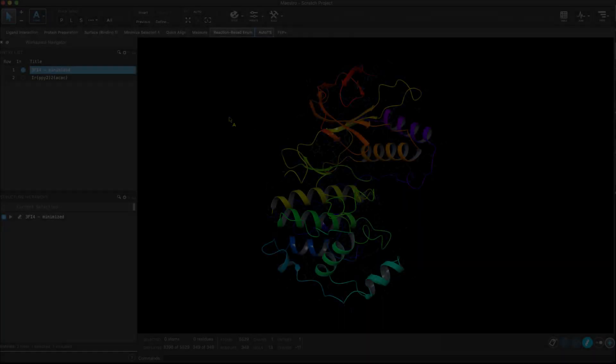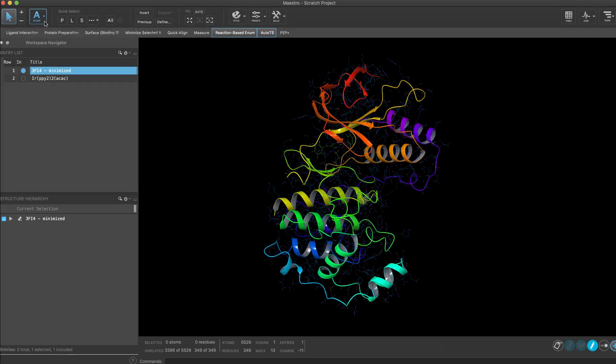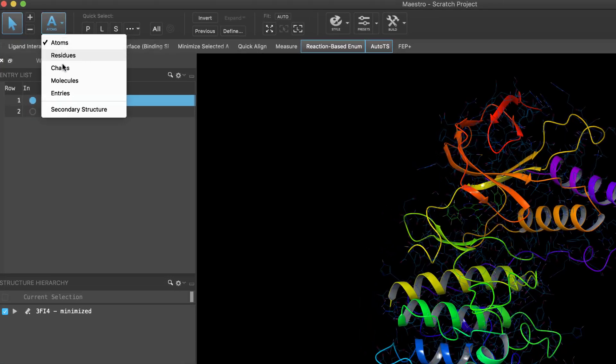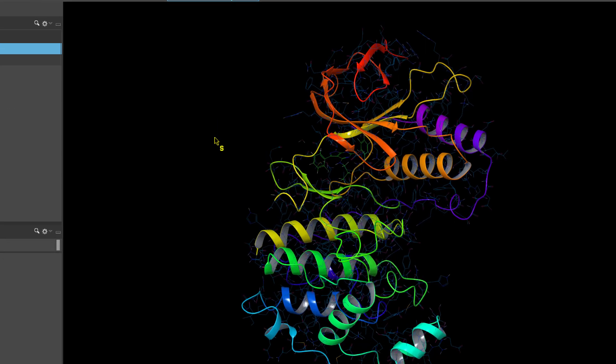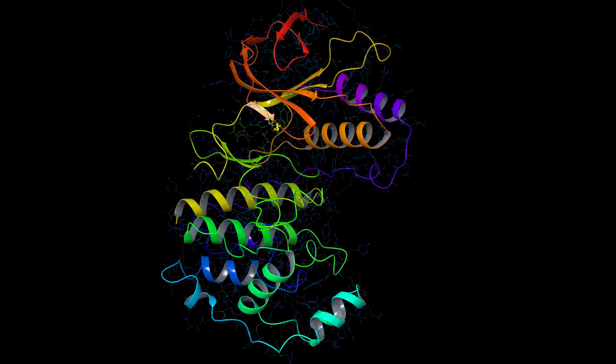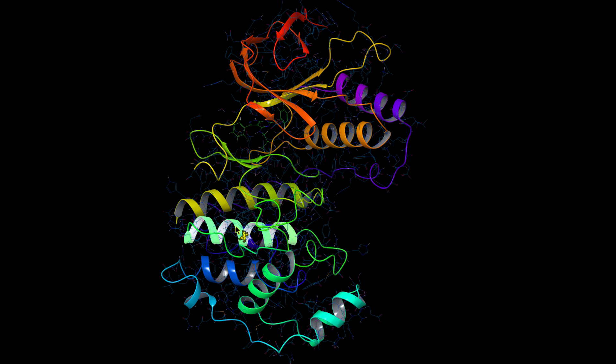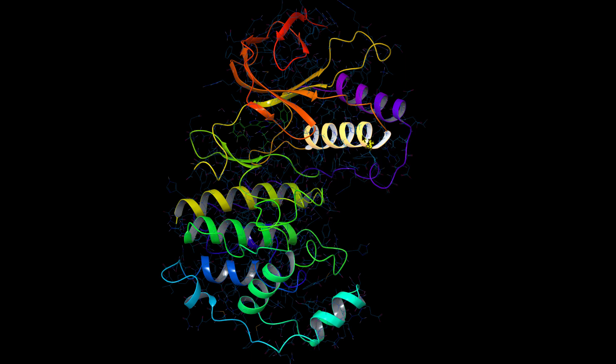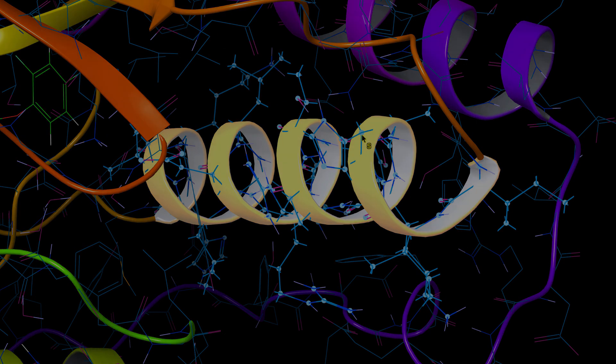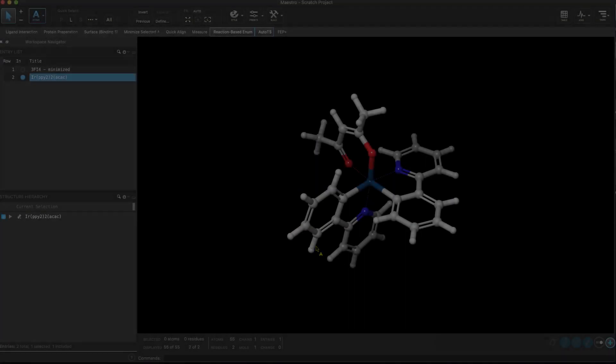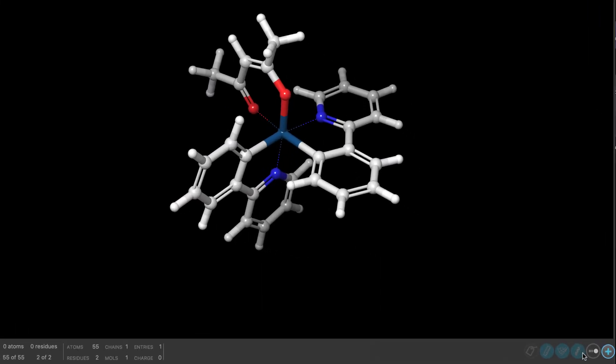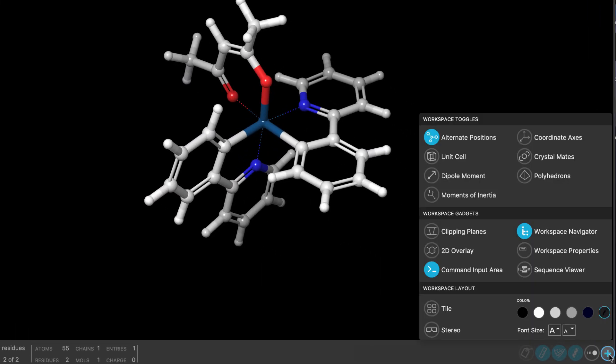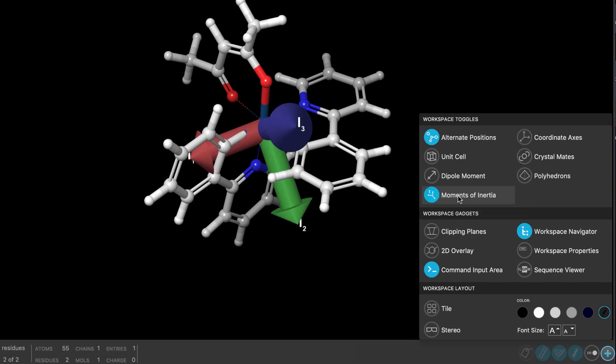Other useful enhancements to Maestro include a new secondary structure mode for quickly selecting the atoms elements within a secondary structure element, and there's also a new workspace toggle for displaying principal moments of inertia.